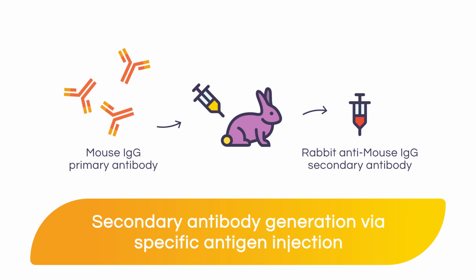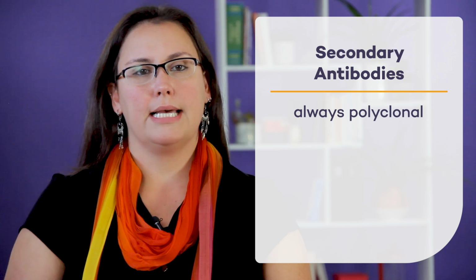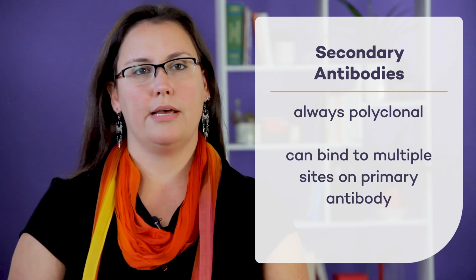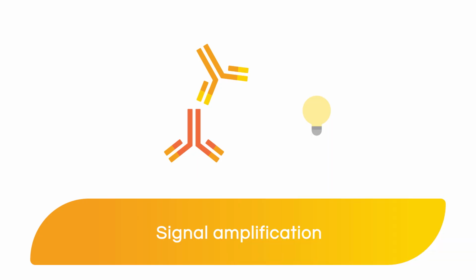As a matter of fact, they are produced exactly as we described for your polyclonal primary antibodies, except that the animals are immunized with an immunoglobulin. It could be a whole immunoglobulin or a fragment of an immunoglobulin. Because of its polyclonal capacity, the secondary antibodies can bind to several epitopes of the primary antibody, which ensures that we're going to have signal amplification when we use a secondary antibody.